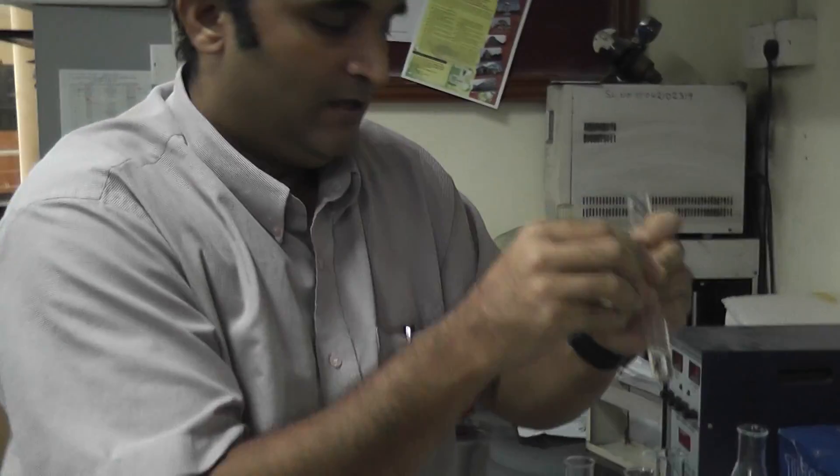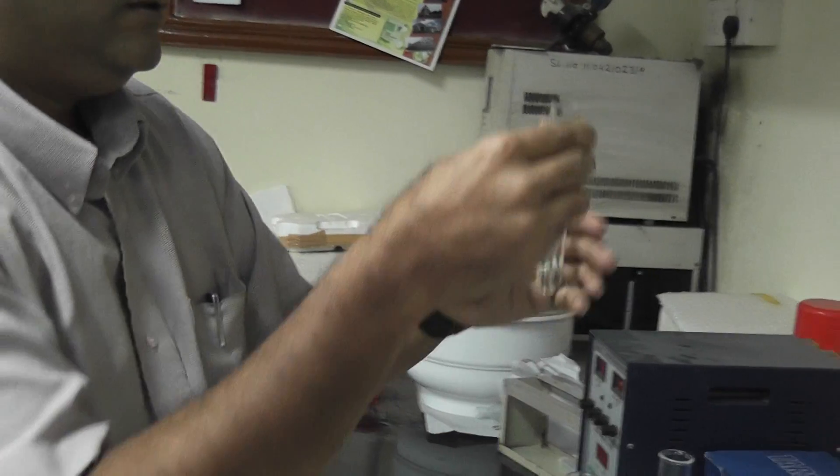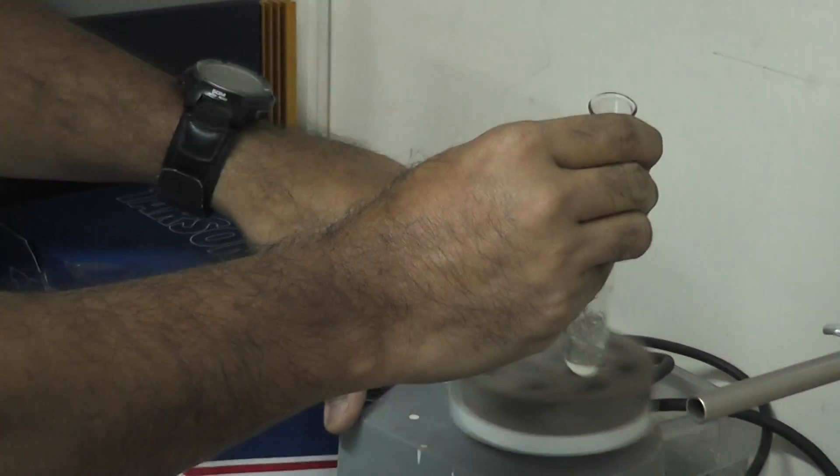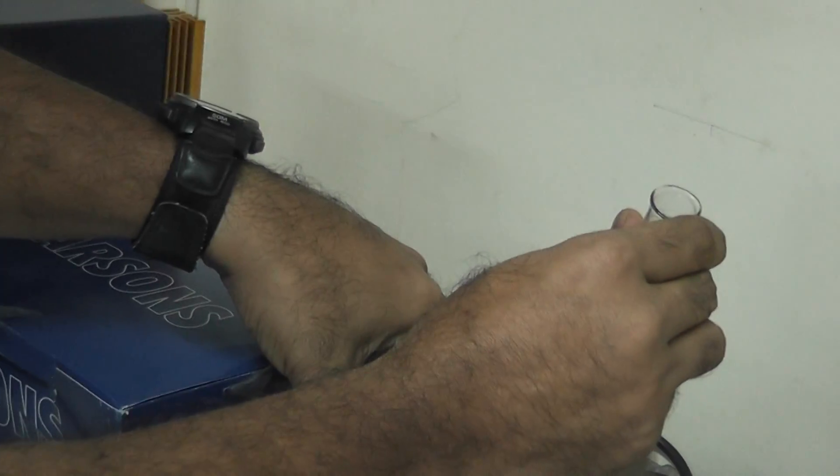Now let us shake this using an automatic shaker. We need facilities like this to help in the synthesis because if we shake by hand it will take a longer time.